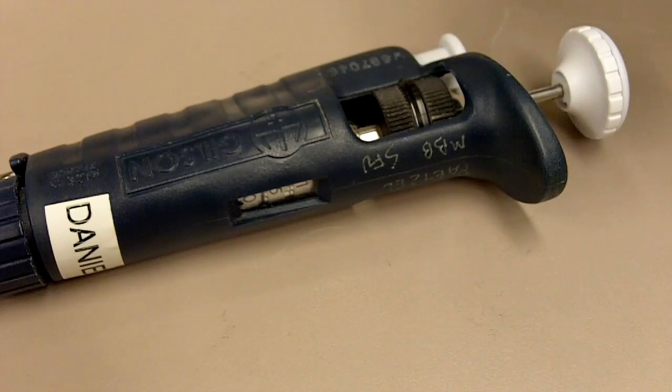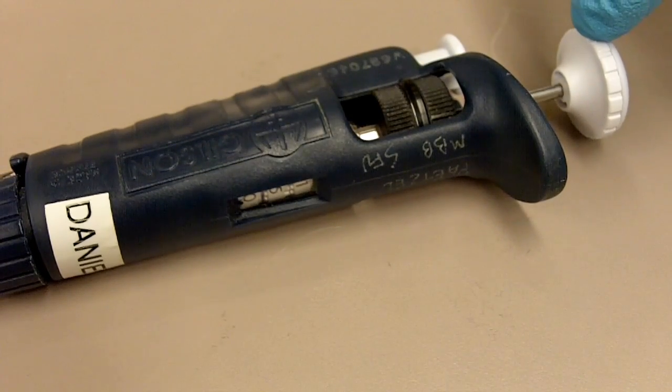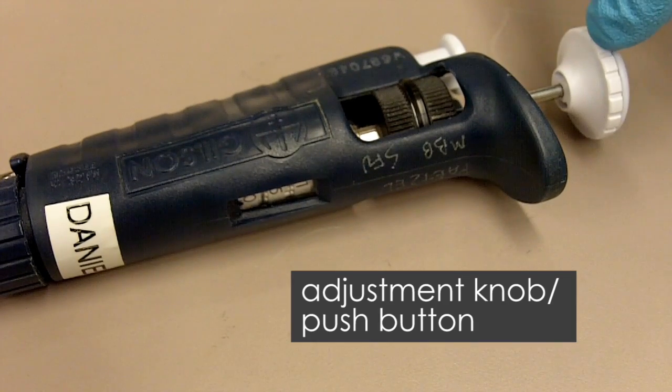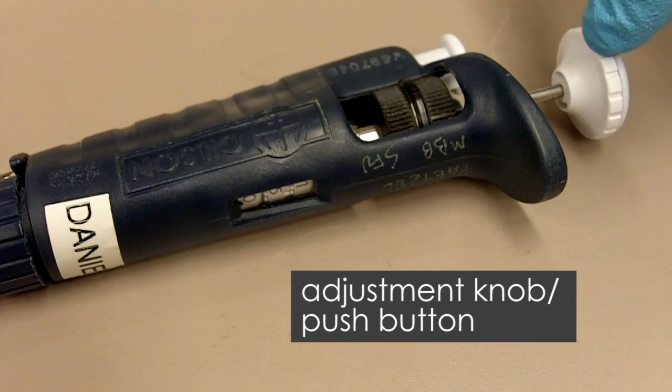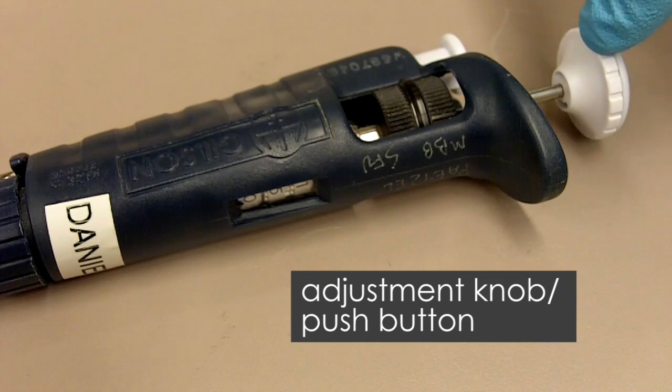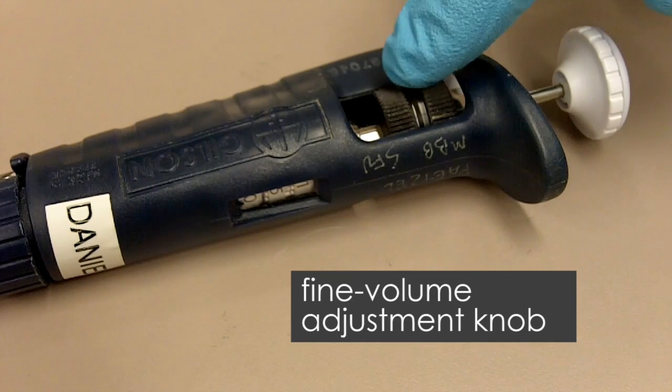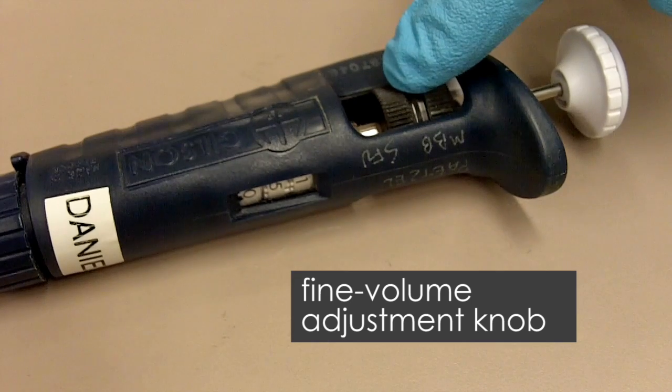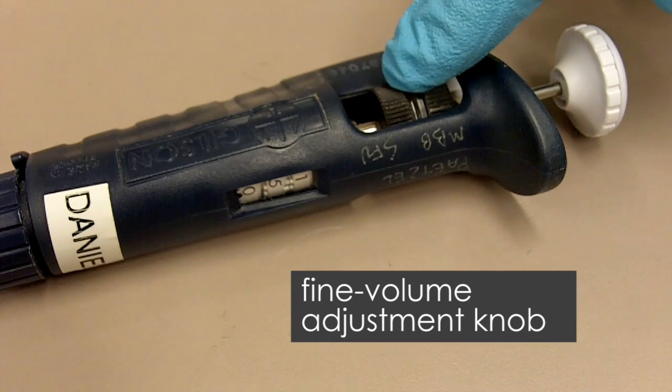And if we look at here, here is the knob that allows you to change the volume. It's also the push button to operate the pipette. And here is the fine tune adjustment knob to change the volume.